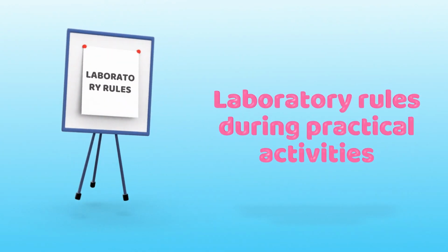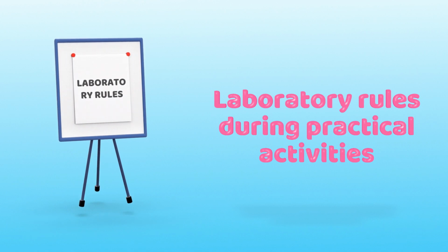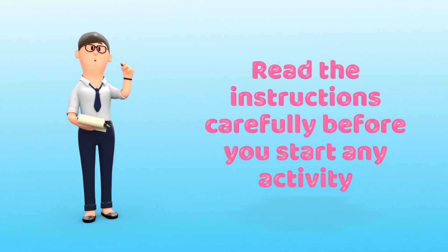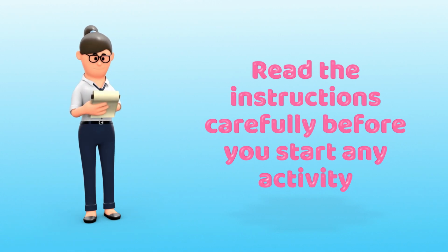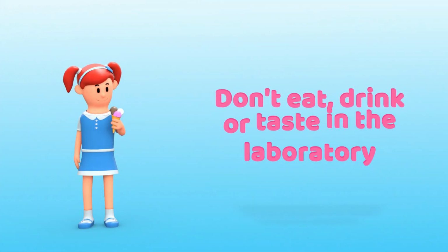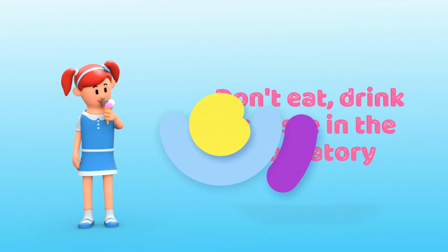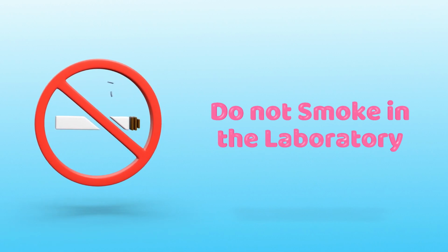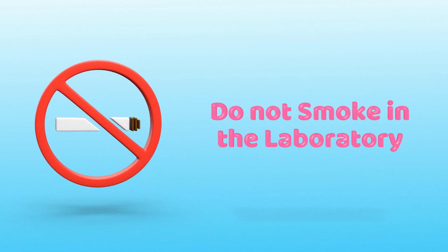And now, let us all pay attention to the rules during practical activities. When you are in the laboratory, you should read the instructions carefully before you start any activity. Also, remember that when you are in the laboratory, we are not allowed to eat, drink, or taste. Do not smoke in the laboratory. This is because there are some chemicals which can catch fire easily and you can cause an accident in the laboratory.